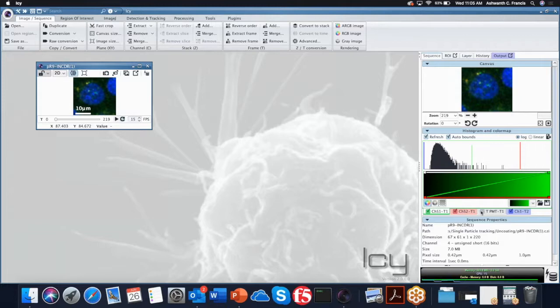Okay. So in this case, in the channel box, you see these threshold lines. Do you see the blue and red lines? Do you guys see that? Right. So these lines actually help you to control the grayscale value of your image. You increase the dark and bright. I mean, this is just for visual appreciation, right? You can make it bright and see a lot of background. You can adjust it to the way you want to see it.